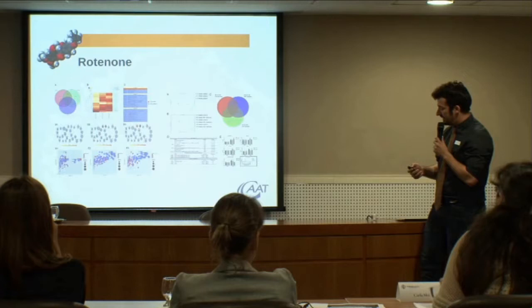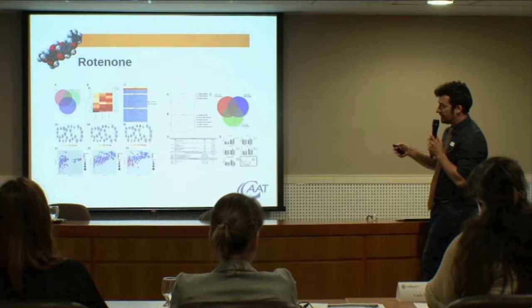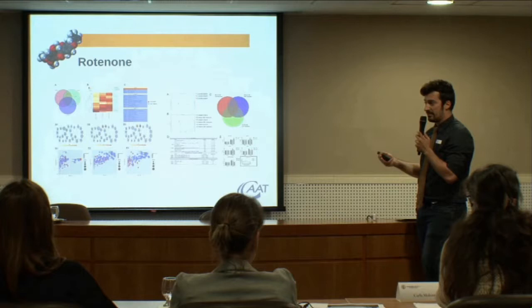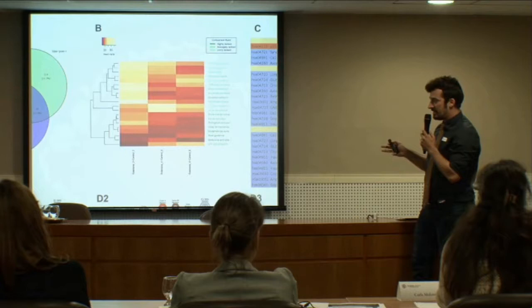The other thing we did was microarrays and extracellular metabolites, because we were trying to find omics approaches to determine mechanisms in the future. We want to use rotenone as a proof of concept that we can predict similar pathways, so that when we test an unknown chemical, we can see if we can predict the same. As you can see, we did the same thing: we chose a concentration that was non-cytotoxic, which is how you normally do toxicology.